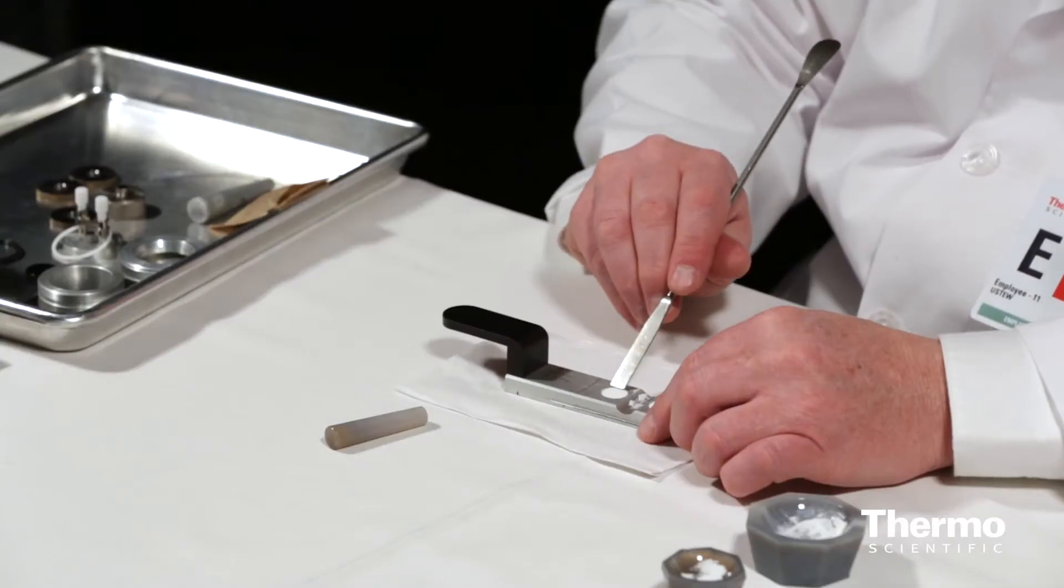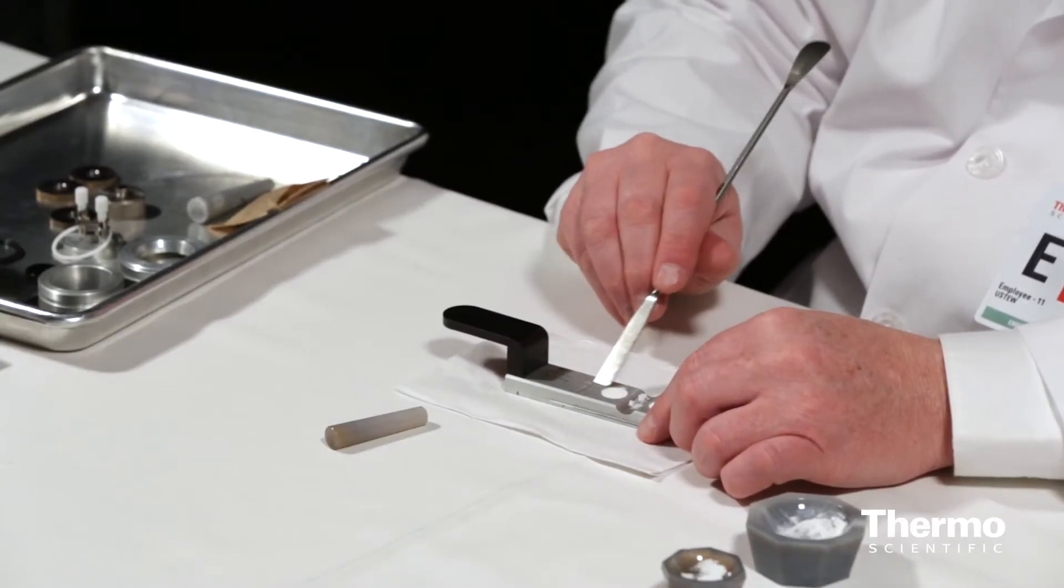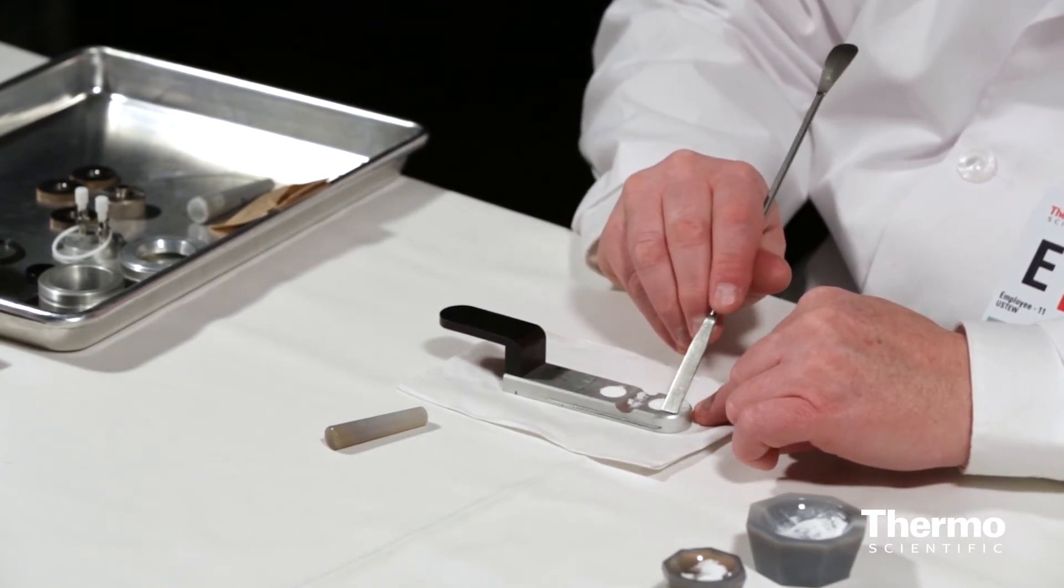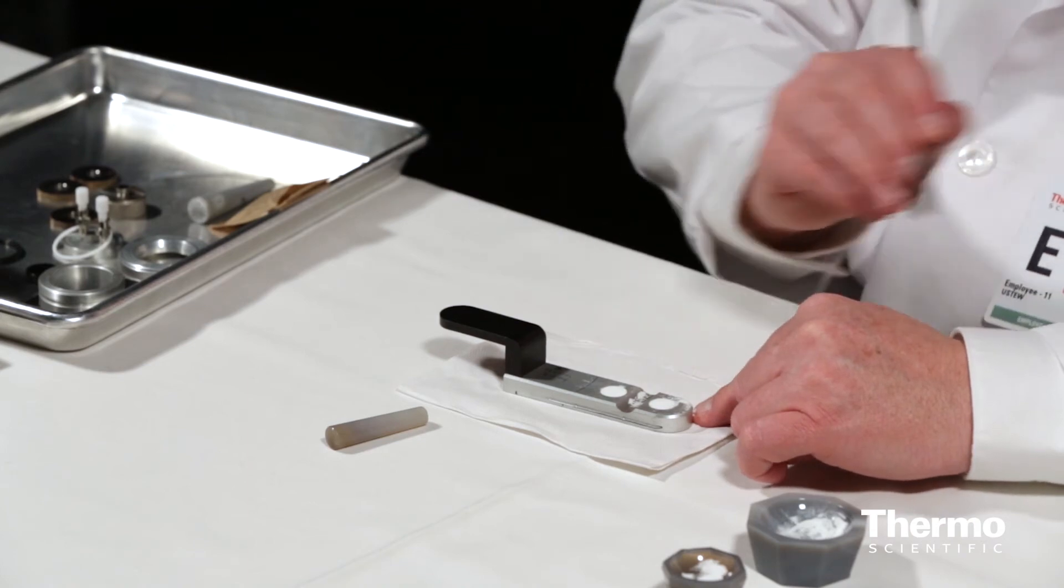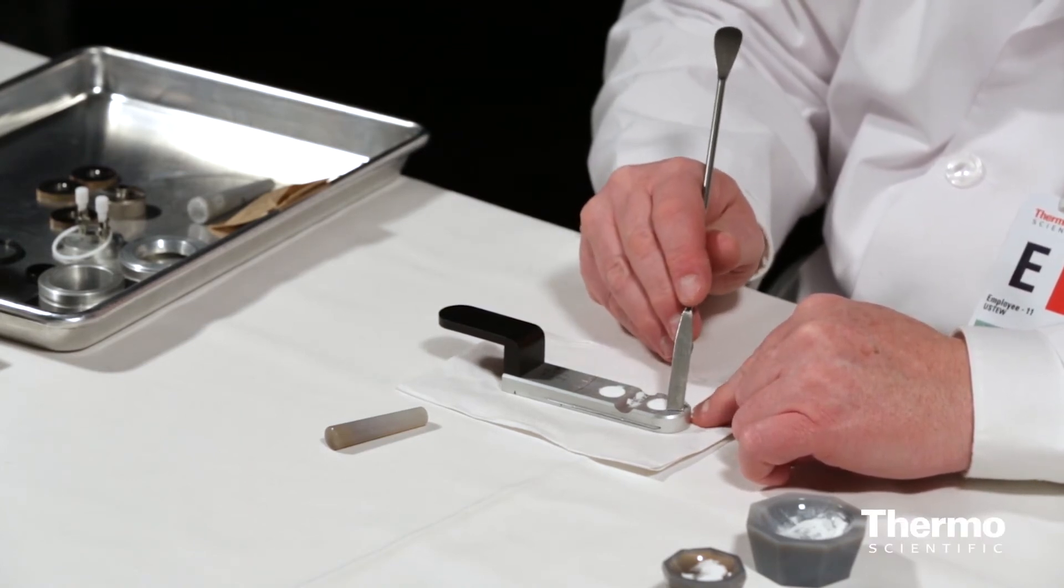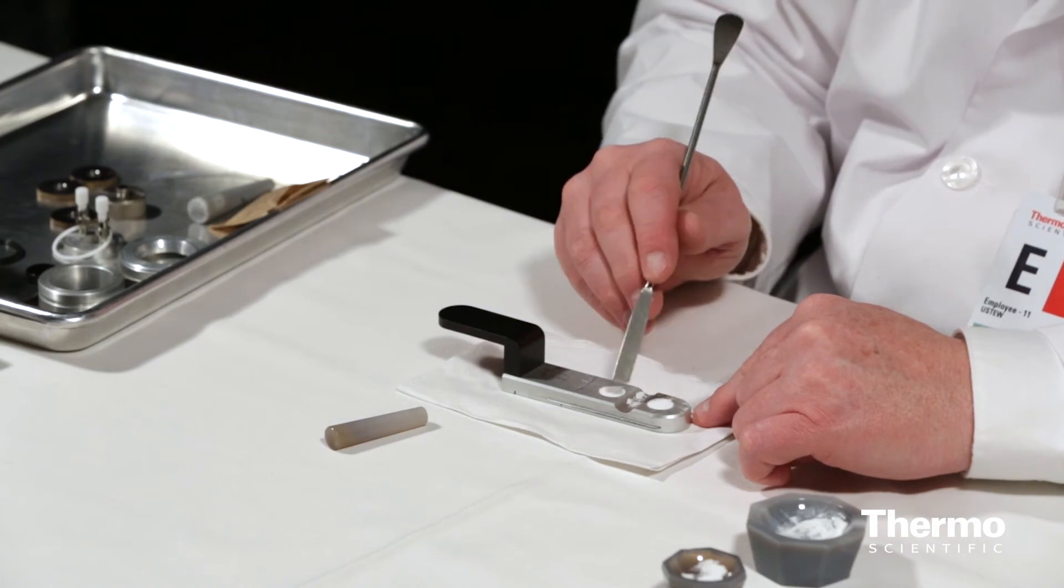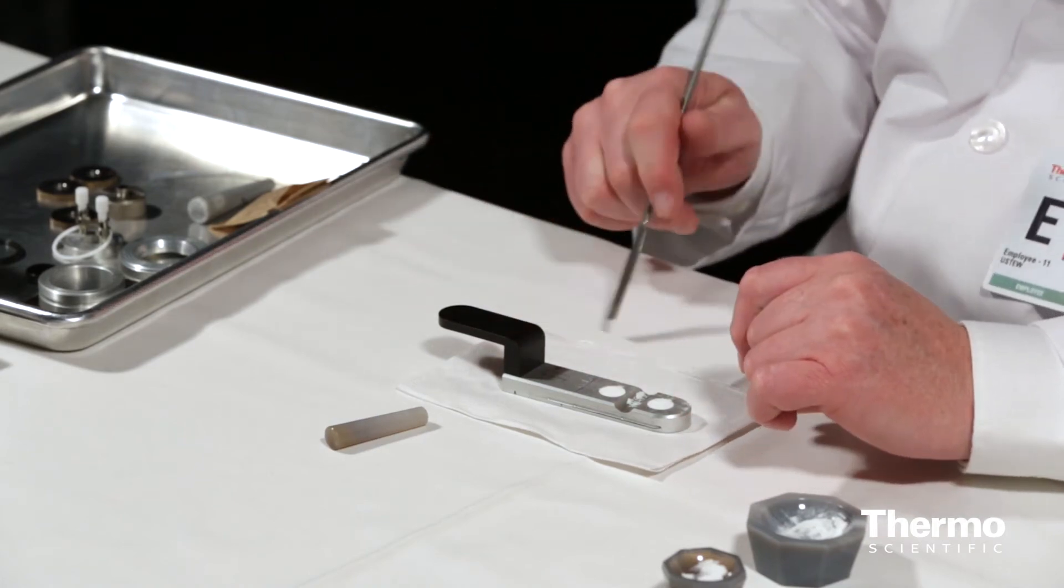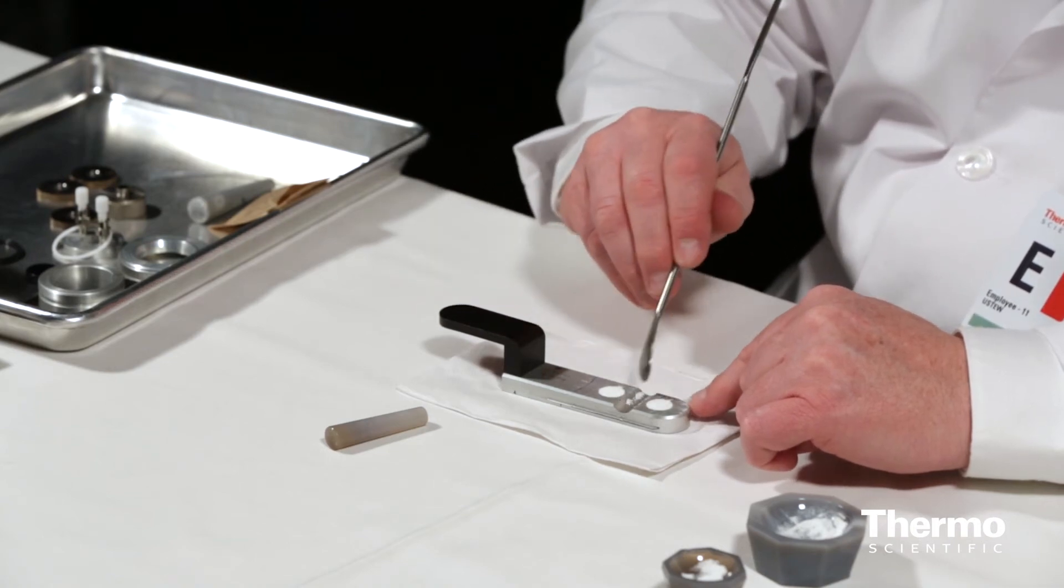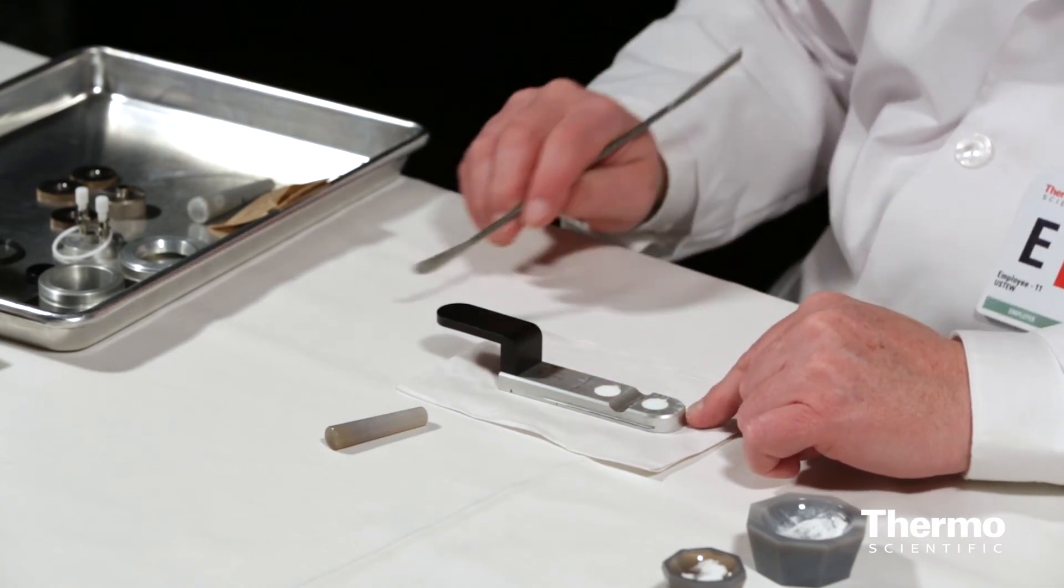And then I'll just scrape off the excess from around the outside edges, which I should be able to do using the spatula without disturbing the sample itself. And if I leave some particles on it, it really won't matter because the optics of this accessory are above the sample, not below it. So any sample that falls off doesn't end up in the optics of the instrument.